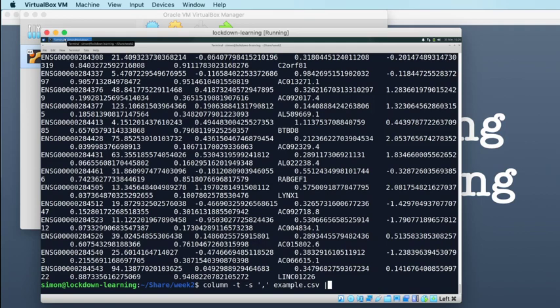Instead of the greater than symbol, which would take this standard output and redirect it into a file, this pipe symbol, this little vertical line, which you can usually find by doing shift and the character next to your enter key if you're on a Mac, or shift and I think it might be the key next to your shift key on a PC keyboard, will redirect to another command instead of to a file. We're going to redirect this output into less.